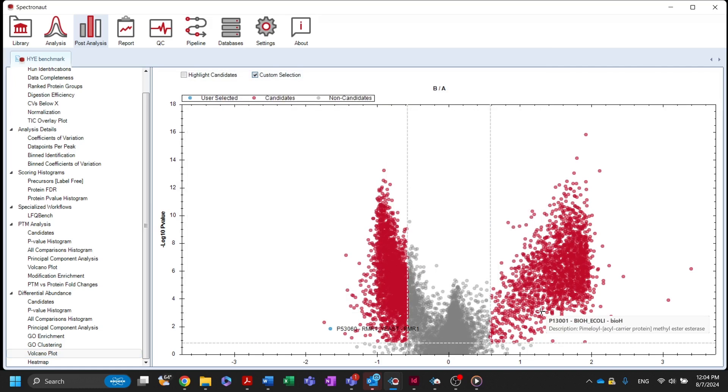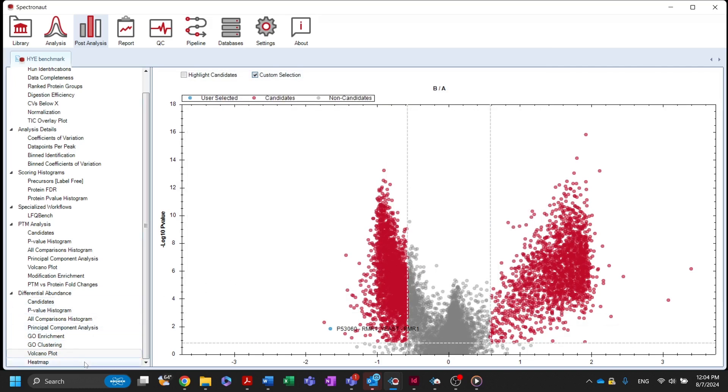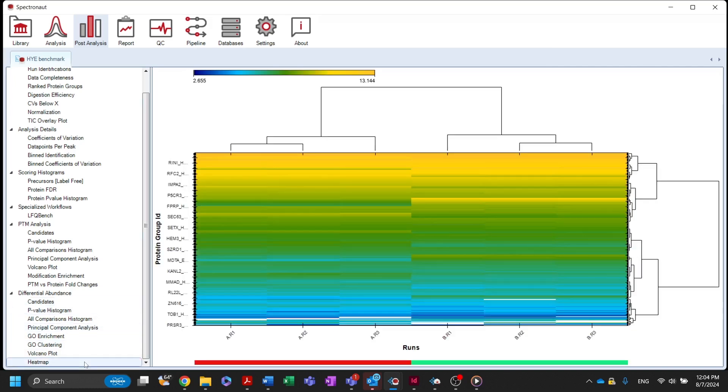A heat map showing the hierarchical clustering of runs across conditions is also available.